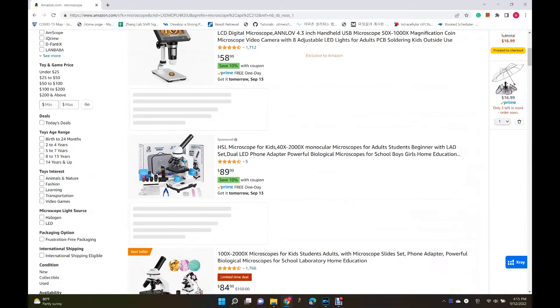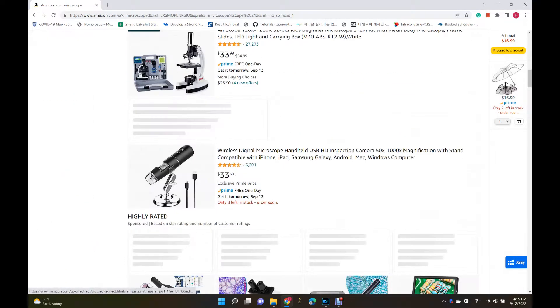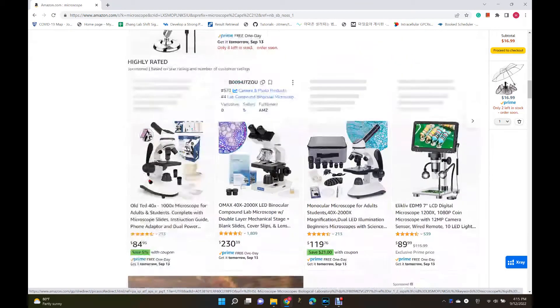Yup, this is PhD Daddy. This time, I would like to review the microscope.